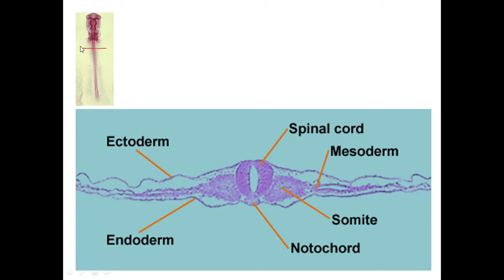Let's move along and down to the spinal cord. So any cut that is made from this area of the animal downward, you can say that the neural tube part can be categorized as a spinal cord. Sides of the spinal cord are flanked by the somites, the paraxial mesoderm that are arranged as blocks. Below the neural tube, you can see the notochord here.